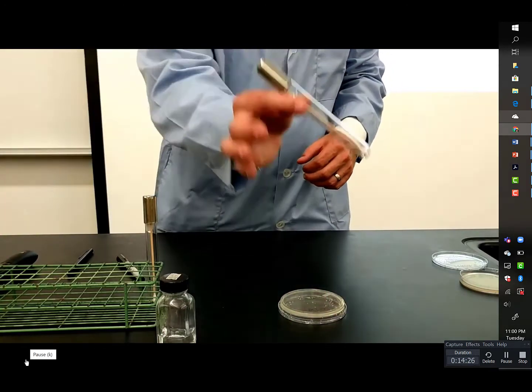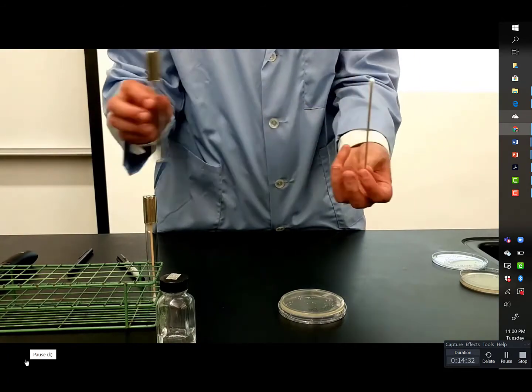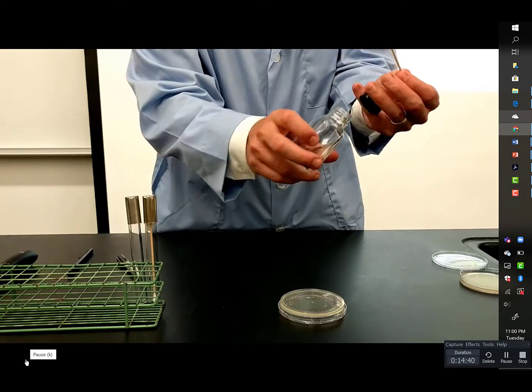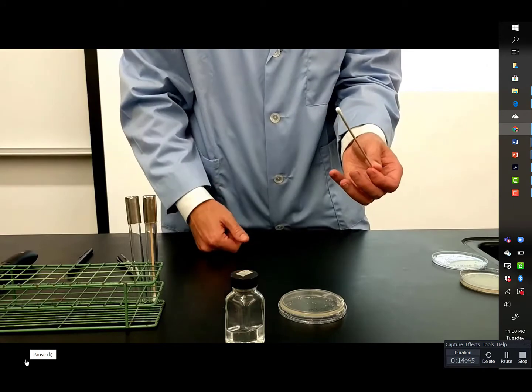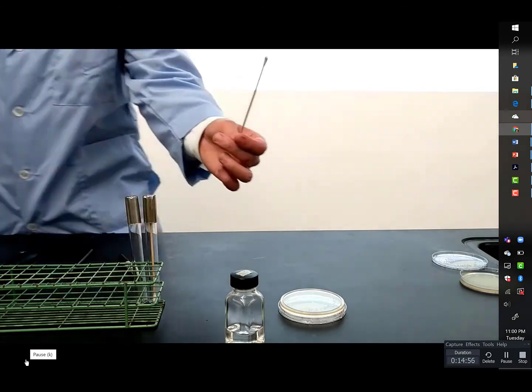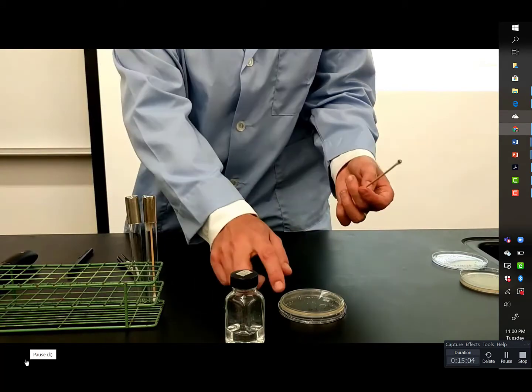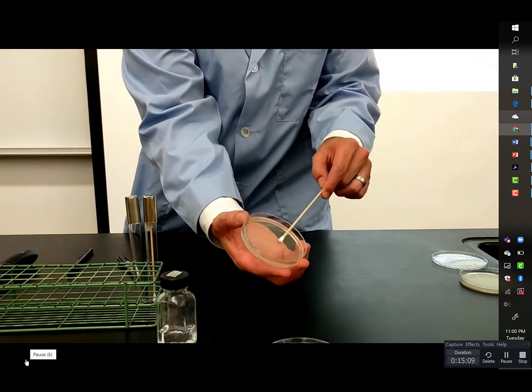So once again, I'm going to take a swab, carefully take it out, and then I'll sample the bottom of my shoe. So I wet the swab, okay, and then give me a moment here. Okay, I just swiped several times on the bottom of my shoe, and I picked up a lot of dirt. It's visibly dirty. No big surprise there. It is a shoe. So I'm going to go ahead and spread this around.